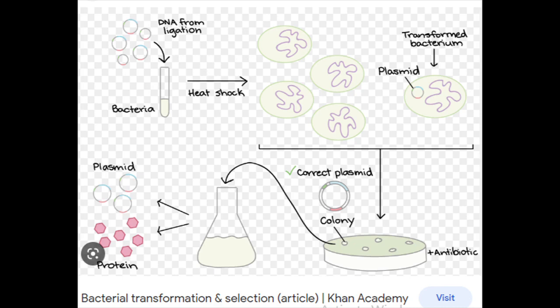You can look directly at the plate, you see the microorganisms, smell, all those things are direct. You still need to do the cultural. Cultural means you grow them on microbial culture. The culture can be in broth, that means liquid culture. Some microbes are grown in liquid culture and some in solid culture.